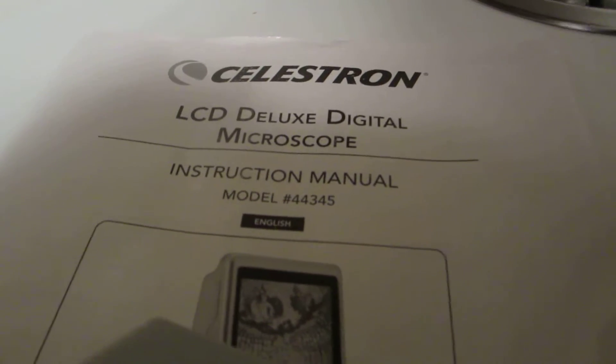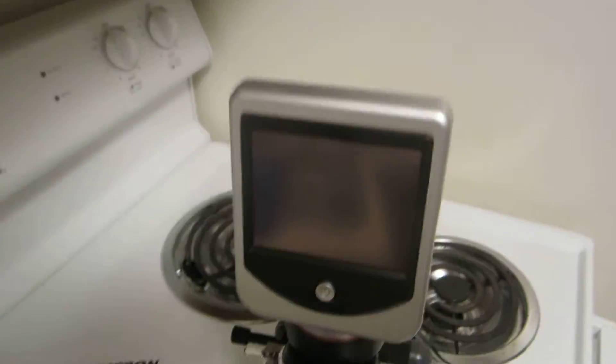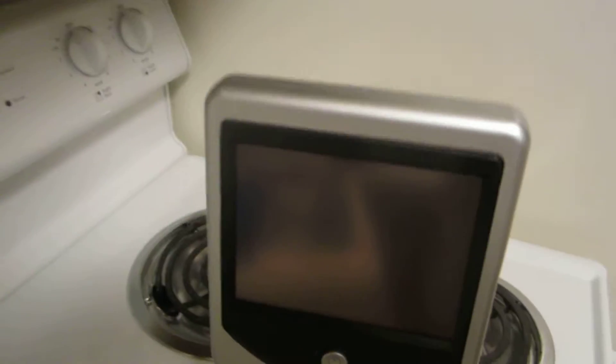This is a quick look at the Deluxe Digital Microscope. It's more a student or beginner's, but it's a lot of fun with a digital viewer.